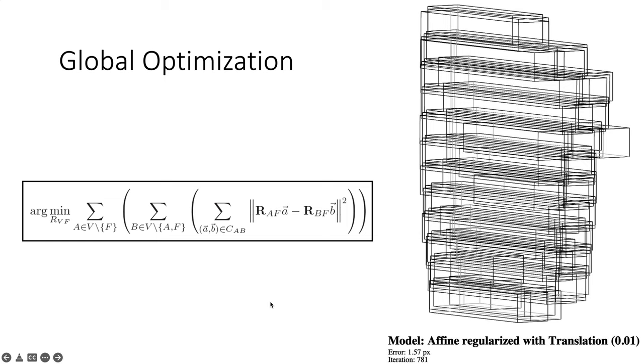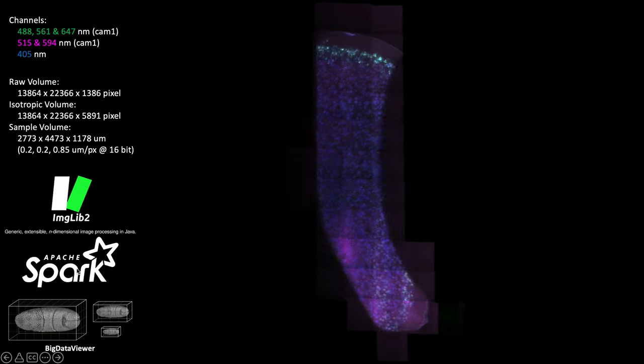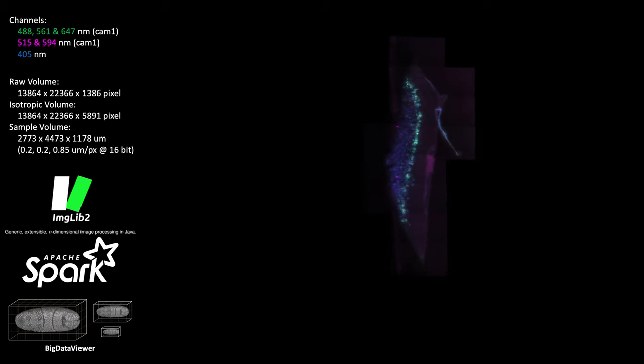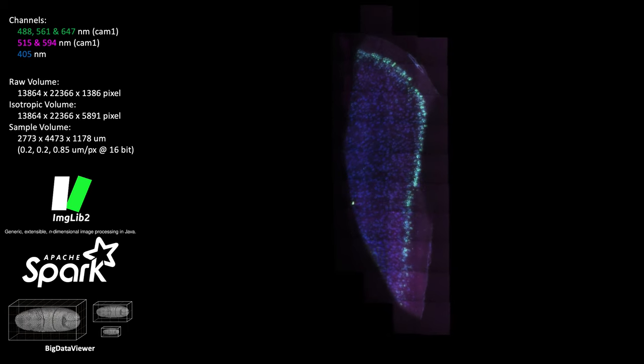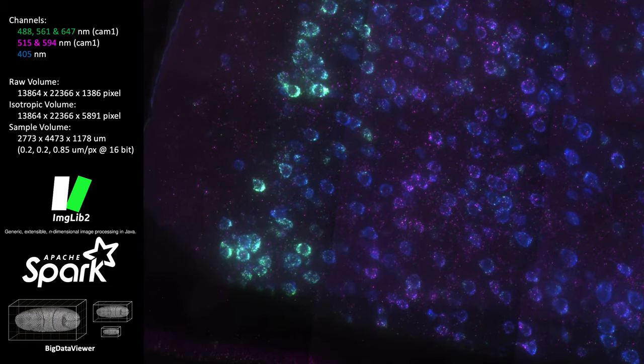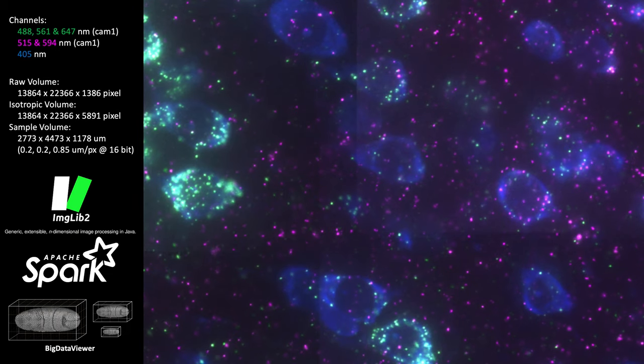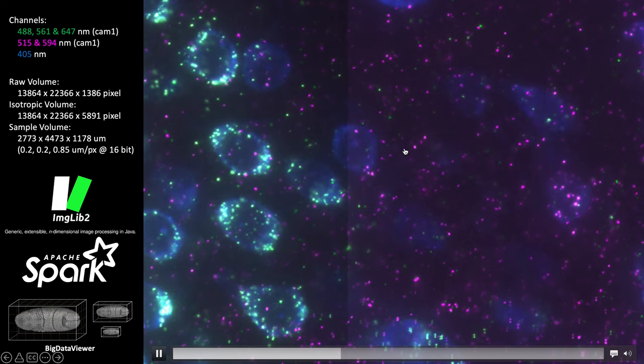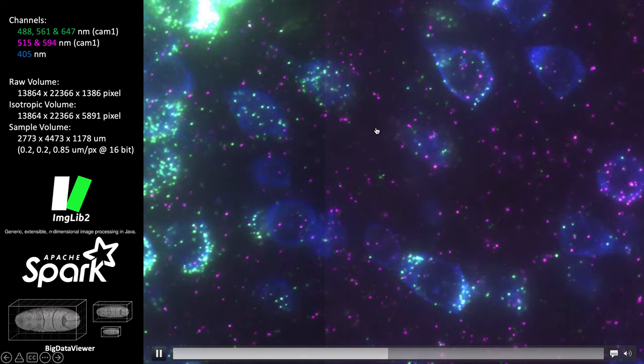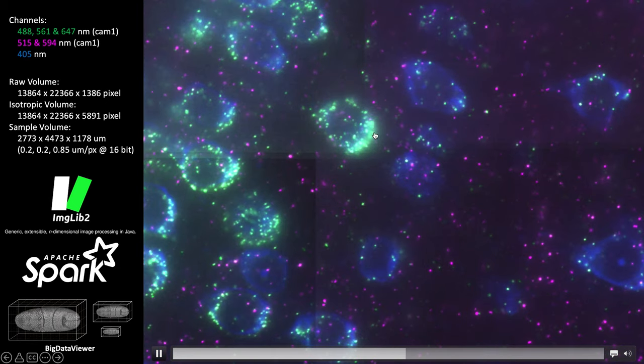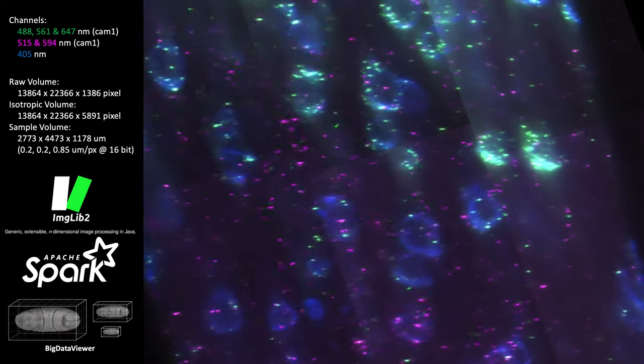Then we can render this. This is computed using Spark, meaning this took one hour to compute, but it can basically be as fast as you want as much as you distribute, so it's only limited by the minimal drop size. Here we reconstructed this gigantic about 10 terabyte dataset, and then you can zoom in with BigDataViewer. You can see all your little single molecule FISH spots in this case that are interesting for studying development in the mouse brain. The little shakings you see here are not an artifact of BigStitcher, that is simply an experimental problem because there are some RNAs that are not that attached and wiggle around in the dataset. The experimentalists have meanwhile addressed that, but this is still older data. It highlights how robust the whole reconstruction pipeline is—it can easily deal with those types of operations.